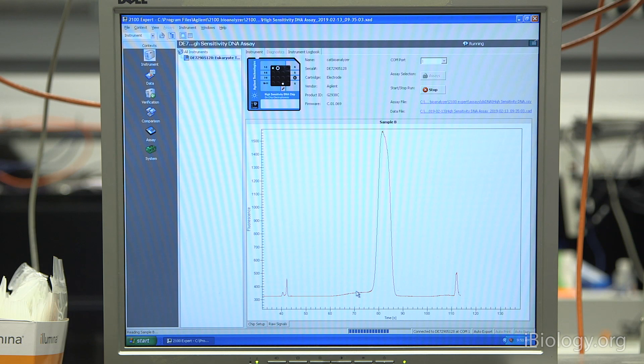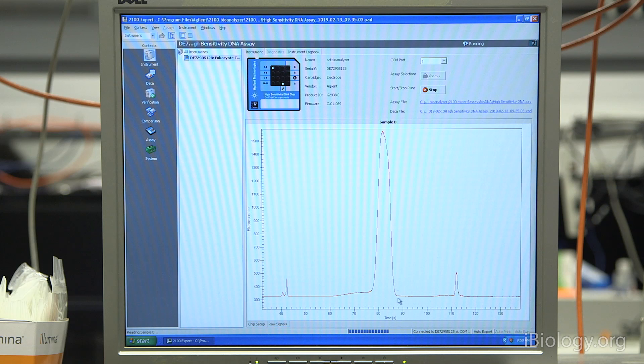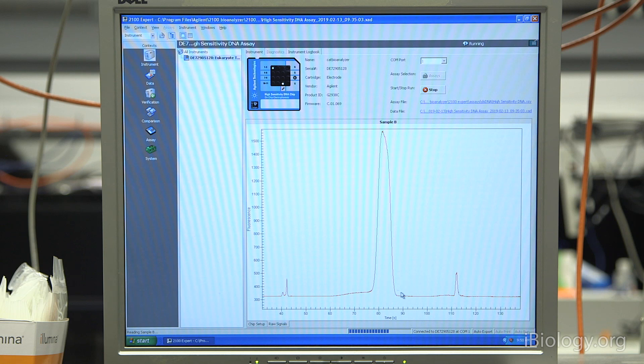Now our second and last sample is running. What you see here is a raw trace from the bioanalyzer, and this is analyzing fluorescence that's being detected as the sample passes through the capillary. On the low end, we have the lower marker, and over here we have the upper marker. These are used as internal references to compare the sample to the ladder that was run first. In the middle here is our library. This is a high concentration sample that is roughly at around 25 nanomolar, and so this is why this smear is so large. You'll notice that the marker peaks are pretty sharp because they're a defined size, and libraries tend to have a spread to them because they come in a variety of sizes.